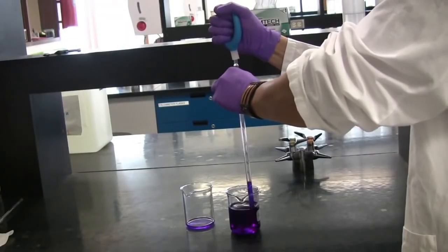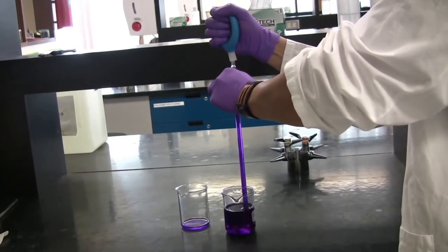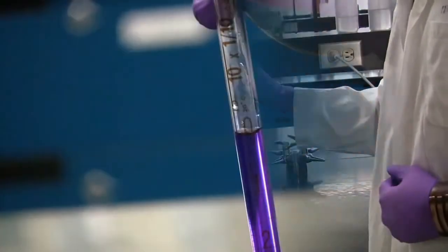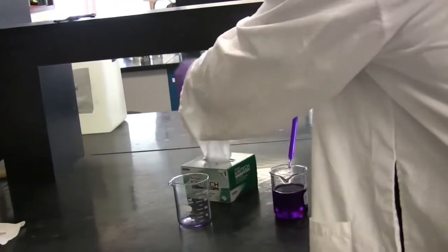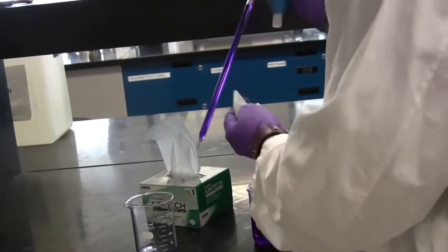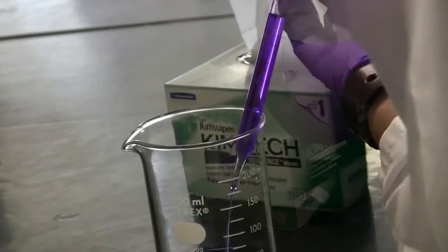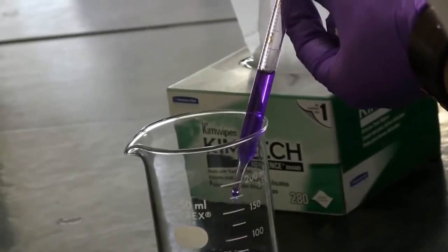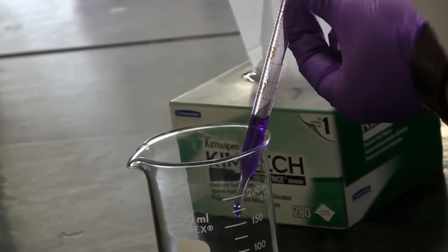Start off using your pipette bulb to withdraw your solution into the graduated pipette. Make sure to stop at exactly the 0 point, as indicated here. Next, take it out of the solution and wipe off the excess with a Kim wipe. Place it into your desired beaker and deposit the solution. Make sure to stop at exactly the 10 milliliter mark, as any below this is excess and needs to be discarded into a waste beaker.